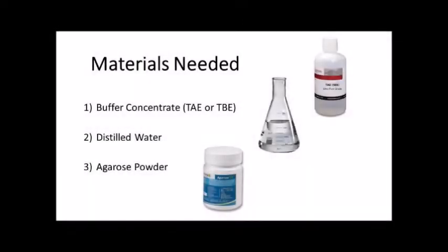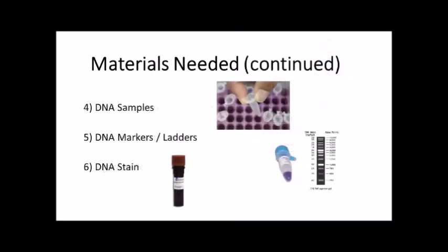Materials needed include buffer concentrate, either TAE or TBE, distilled water, and agarose powder. Also needed will be DNA samples and DNA markers or ladders. In our case for our demonstration, we'll only be separating DNA markers on our gel, and we'll also need some DNA stain so the DNA can be visualized once separated on the agarose gel.